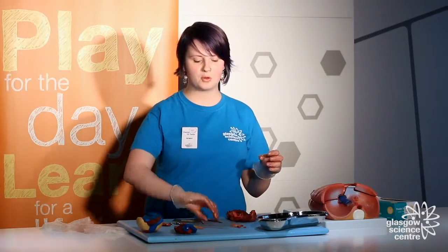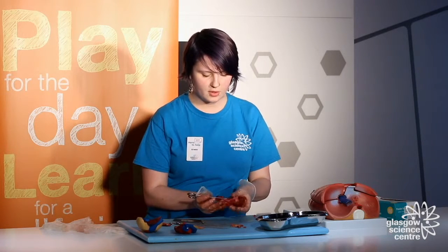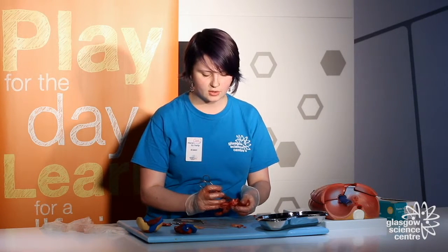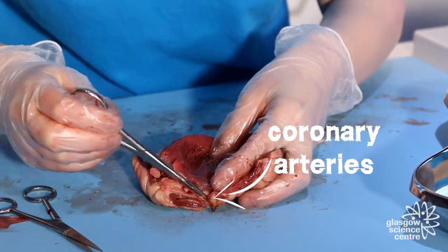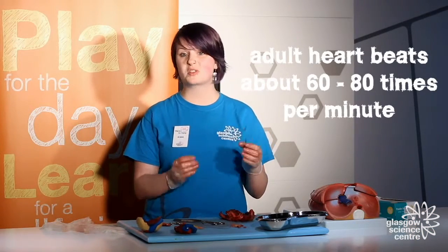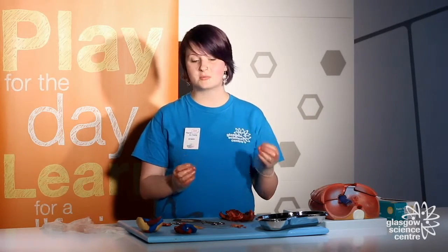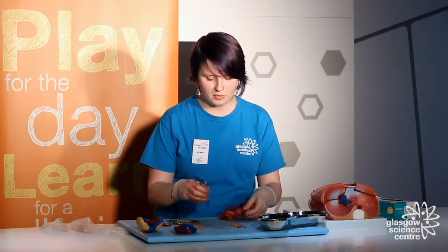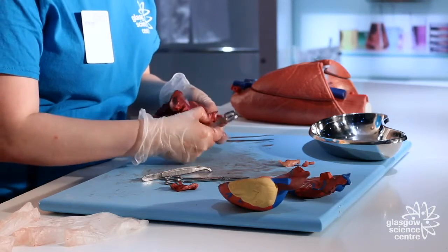The final thing I want to point out is our coronary arteries. These are the blood vessels that provide oxygenated blood to our heart muscles. If you look behind our semilunar valves, you can see two small openings — these are the entrances of our coronary arteries. Our heart is a huge muscle that needs to pump roughly 60 to 80 beats per minute for adults, and this requires a lot of oxygenated blood, which the heart supplies through a large pathway of these arteries.